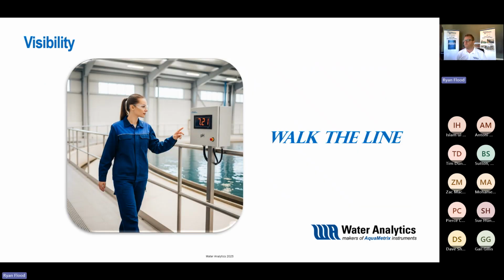in this exercise. The first one I like to refer to here, right, is walk the line. For those of you that have been in facilities in the water industry, this is probably a pretty common term to you. And it's what a lot of operators do. They will walk around their facility and simply check all the screens to make sure that the readings are within the specifications that they're looking for. So in this example here, being 7.21, right? Again, this operator is walking past and says, "Yep, that value looks about good," and moves on to the next part of her walk. And that is something that's really important, right?